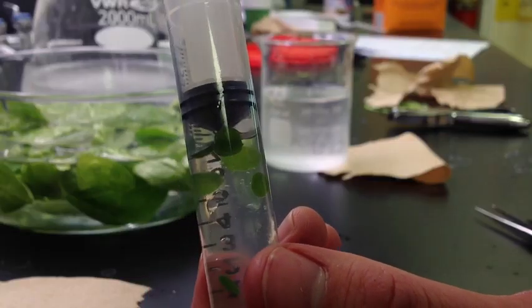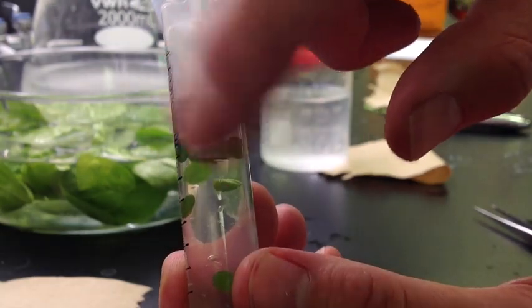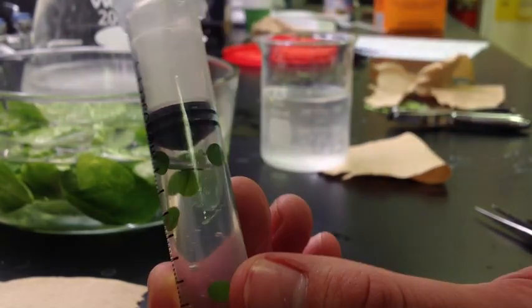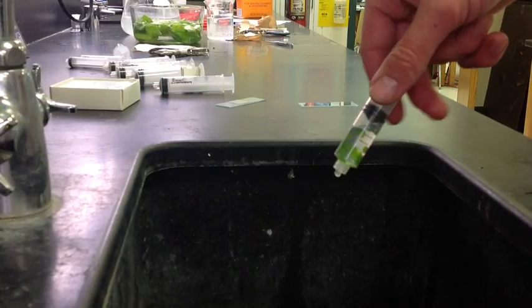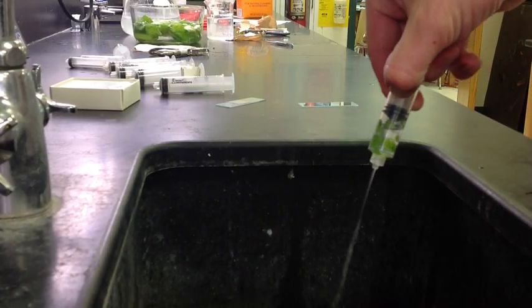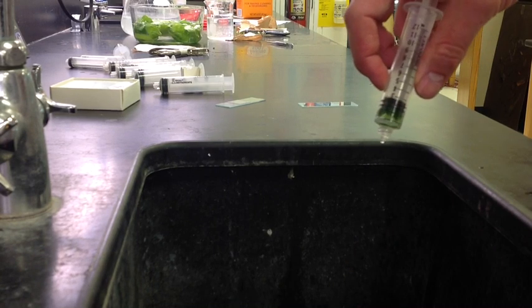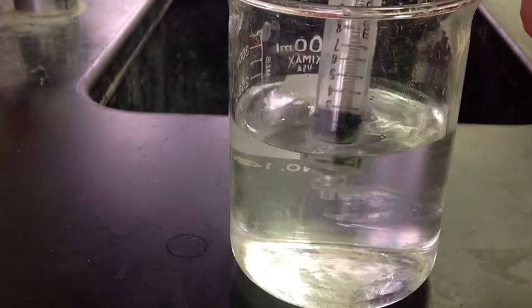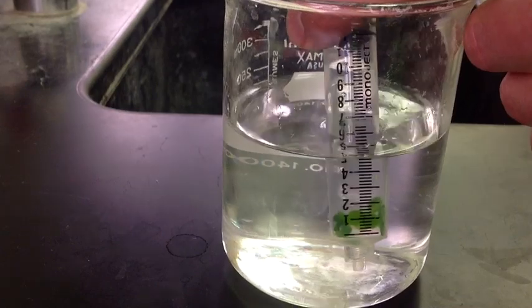Occasionally you may get some leaf discs stuck at the top — just gently tap them down to get them to fall off the side. Once your leaf discs have fallen to the bottom, push out the baking soda solution into a sink, squirting out most of the way until you have just a couple of cc's left. Next, soak up 10cc's of tap water without baking soda.